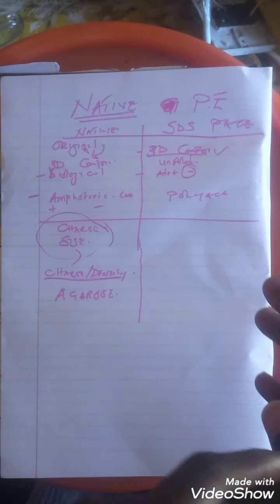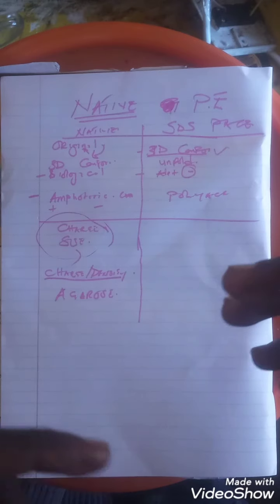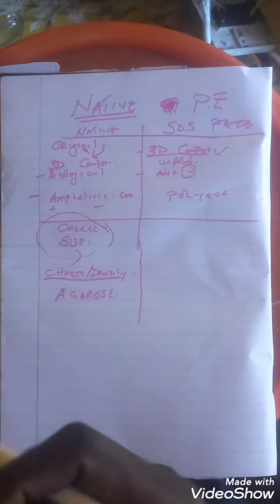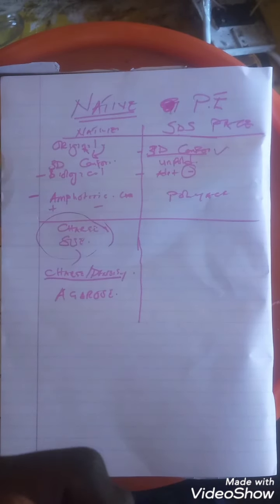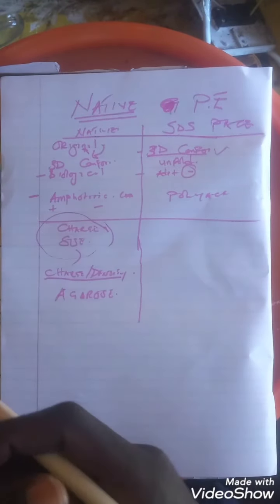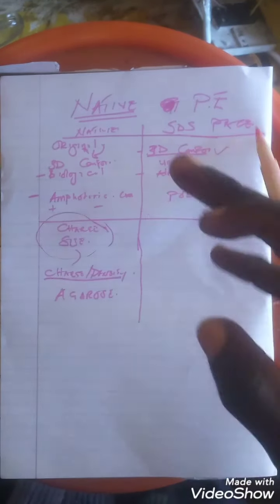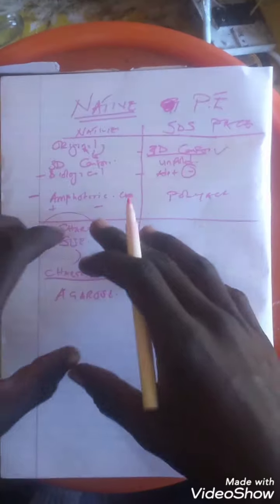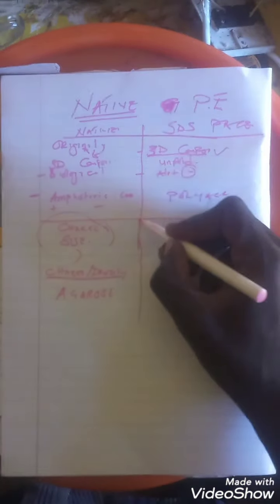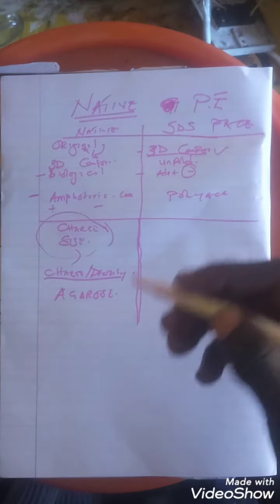But in SDS-PAGE, since the proteins are denatured, there is pretty much nothing there to look at or to use. So SDS-PAGE is entirely based on separation, but native protein electrophoresis can be used to look at characteristics and everything of enzymes, which are proteins, and hence after the separation technique, they can be reused because they are still biologically active.